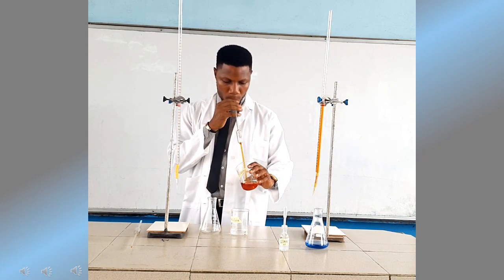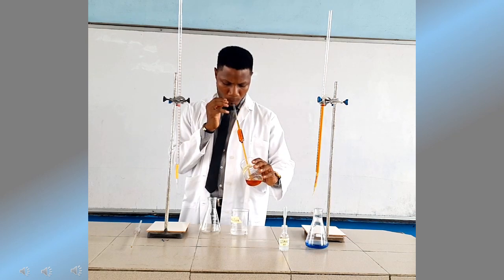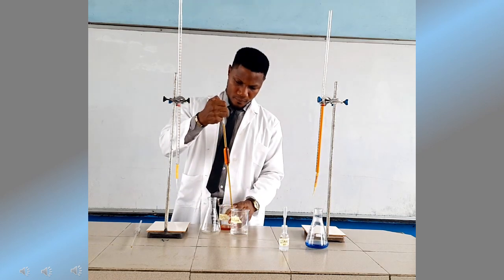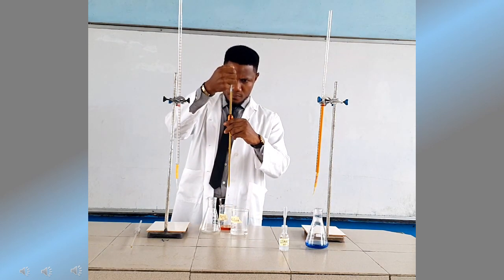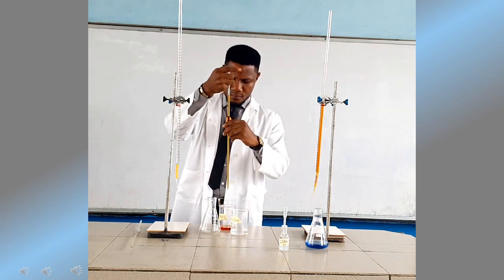Then the iodine solution is sucked with a pipette and transferred into the conical flask. Just as you could see right now, you suck it with the pipette and you transfer it into the conical flask.